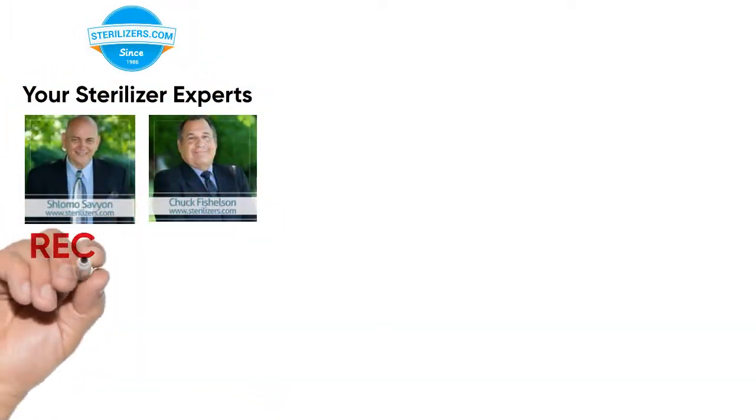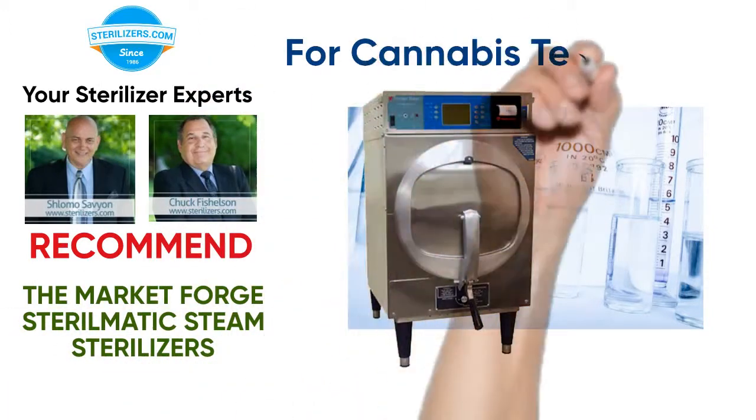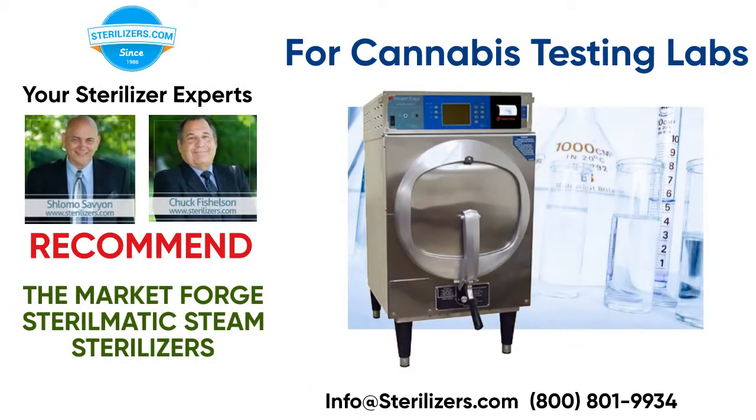Your sterilizer experts recommend the Market Forge Sterilmatic Steam Sterilizers for Cannabis Testing Labs.